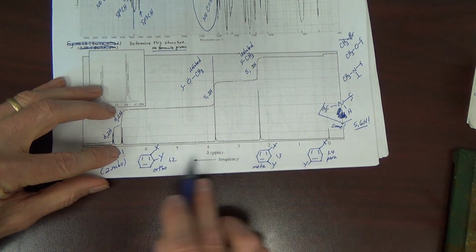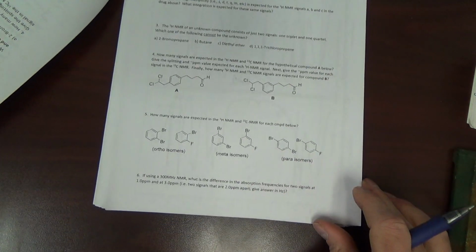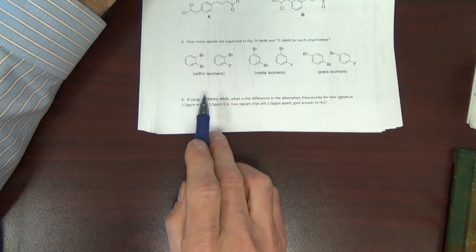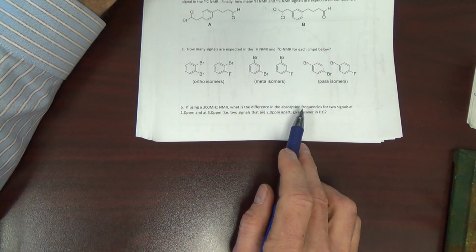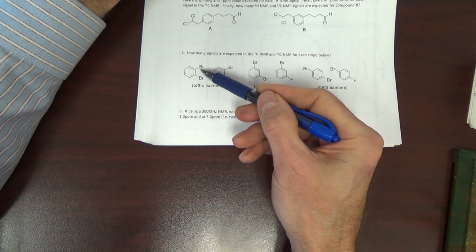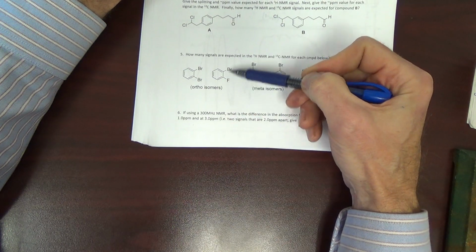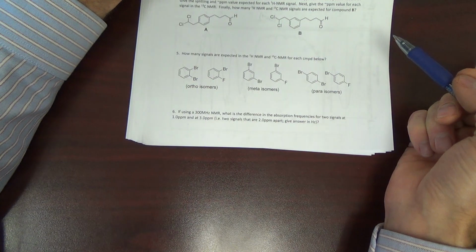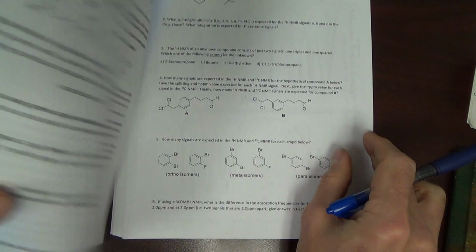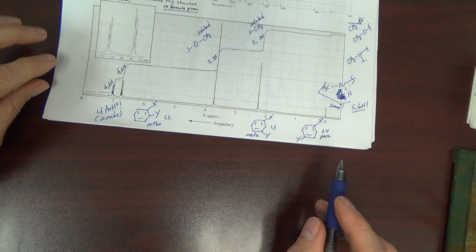By the way, this type of analysis here was sort of on the first page, particularly number 5 here. Okay. Now the answer is going to vary. If the two substituents are the same, you're going to get a different answer here for a number of signals compared to when the two substituents are different. All right. But number 5, very important, very useful. Okay.